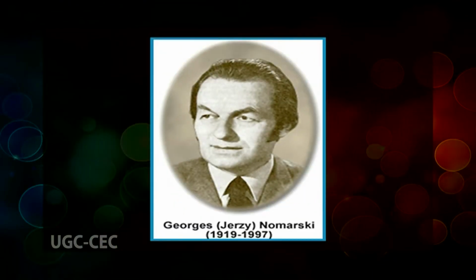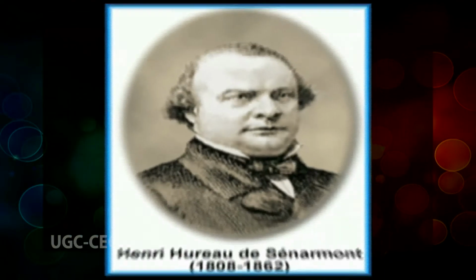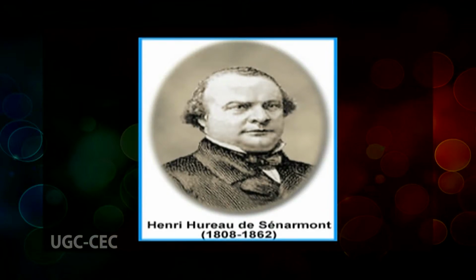The height of a hill is a product of both the actual thickness of the feature and its refractive index. Variations of the DIC system are named after their originators, Nomarski and de Sénarmont. Options can be selected to maximize either resolution or contrast. These were all types of light microscopy.